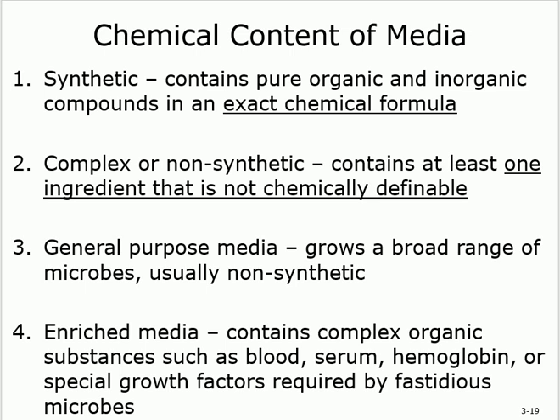And you use that like, here is a patient that's in critical condition and I need, like, half an hour and you tell me exactly what it is. You cannot wait for the other media, right? The other media you can wait hours and days, right? You don't have that leverage. If you need to grow it really fast, what should you do? Enriched media. Okay?